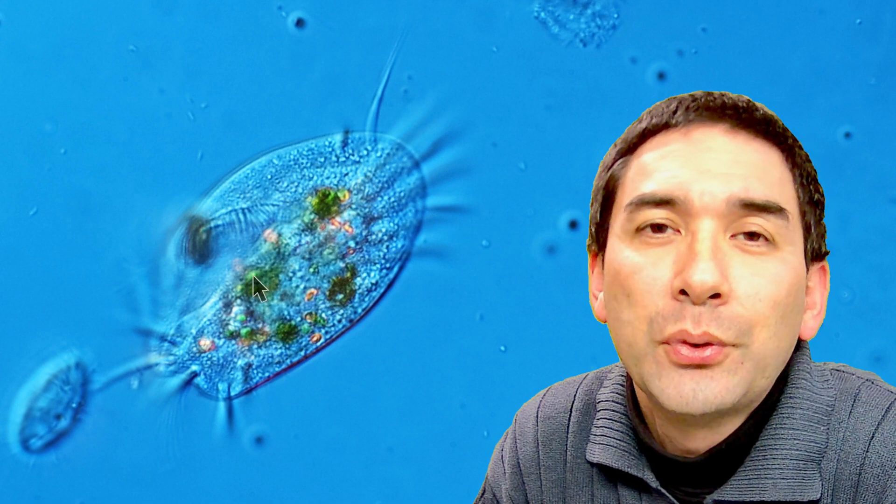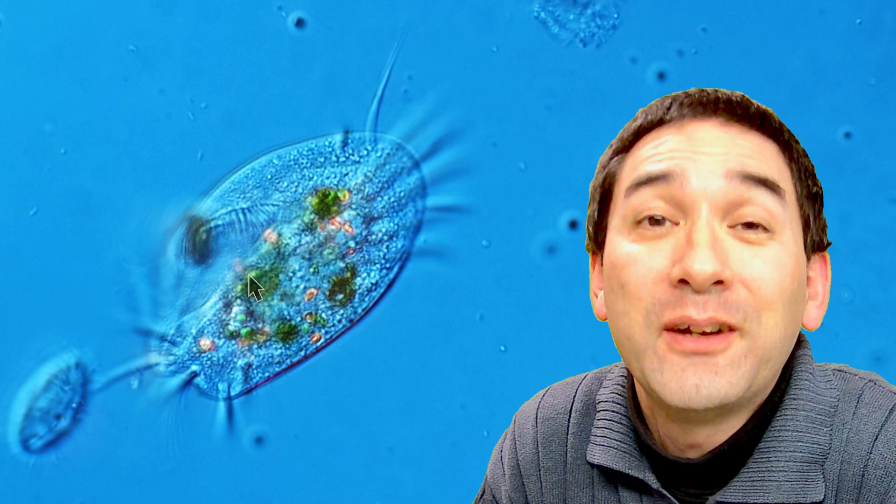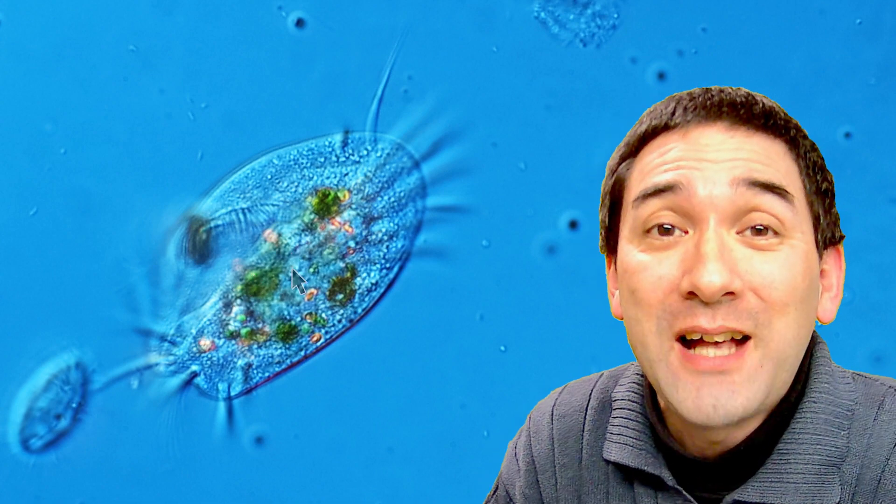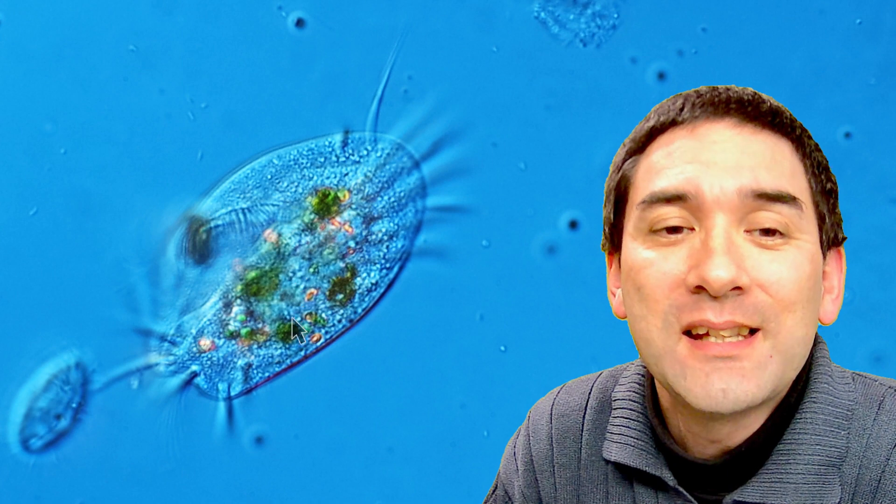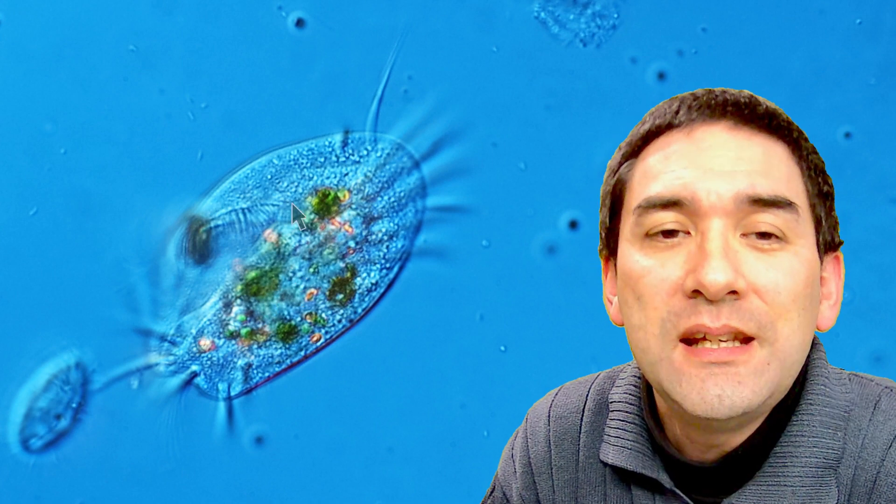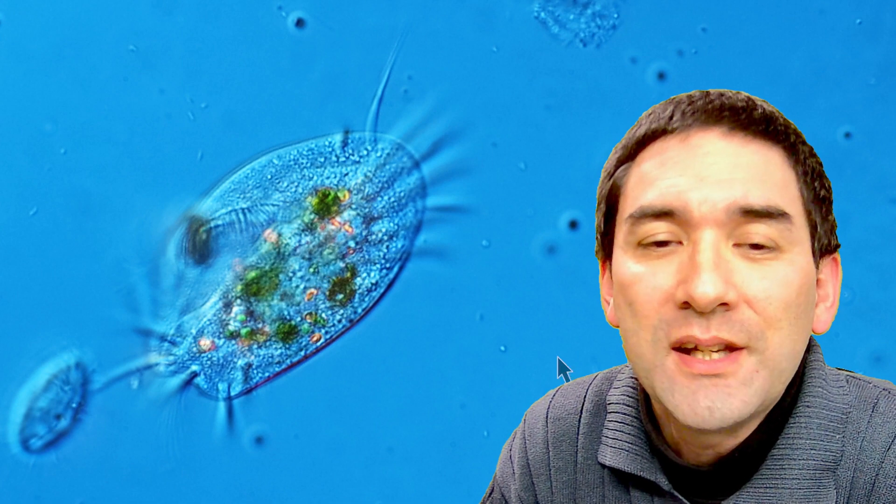And I mean there are some protozoa out there that are eating the algae as so-called endosymbionts. Those algae are then living inside the cell. But over here I think it looks rather like food that it has eaten and is now being digested.